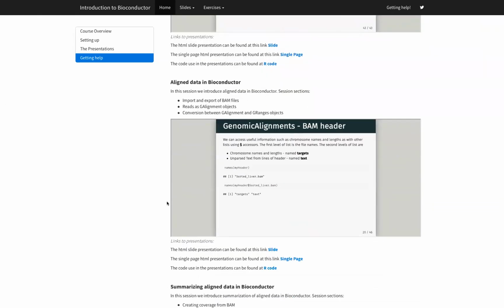And then in our last session, we saw how we can manipulate these in more memory-friendly ways, such as sorting using very low memory or very high memory if you've got a big computer, and also how you can really dig down into the BAM file and have a look at what's happening underneath, looking at the reads directly.